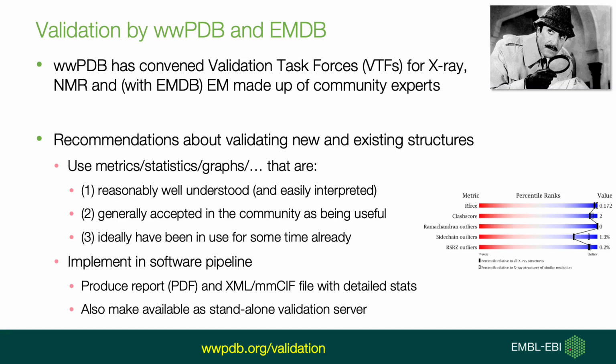wwPDB has convened validation task forces for X-ray in 2008, for NMR in 2009, and for EM in 2010, made up of community experts, and they've given recommendations. Some of the core recommendations have been that we should use metrics that are reasonably well understood, easy to interpret, generally accepted in the community as being useful for validation purposes, and ideally have been in use for some time, so we have good experience and understand the strengths and the weaknesses.